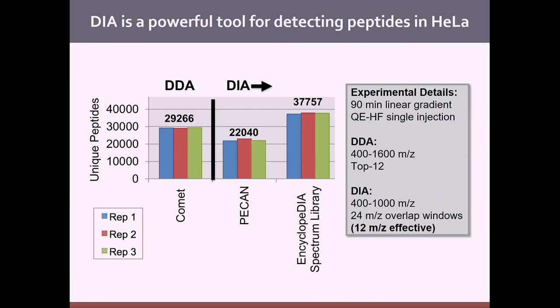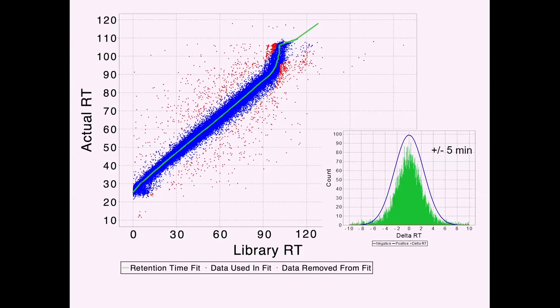So this is, at this point in time, very similar to the workflow that you would have with OpenSwath or Spectronaut or PeakView. We're using a set of features that are calculated based on the spectrum library, using things like iRT and also the fragment ion intensities, et cetera. We're using Percolator basically as a machine learning algorithm. That's not that different. So again, we're definitely doing better than the number of things detected in DDA. So one of the things he noticed right off the bat was the use of iRT.